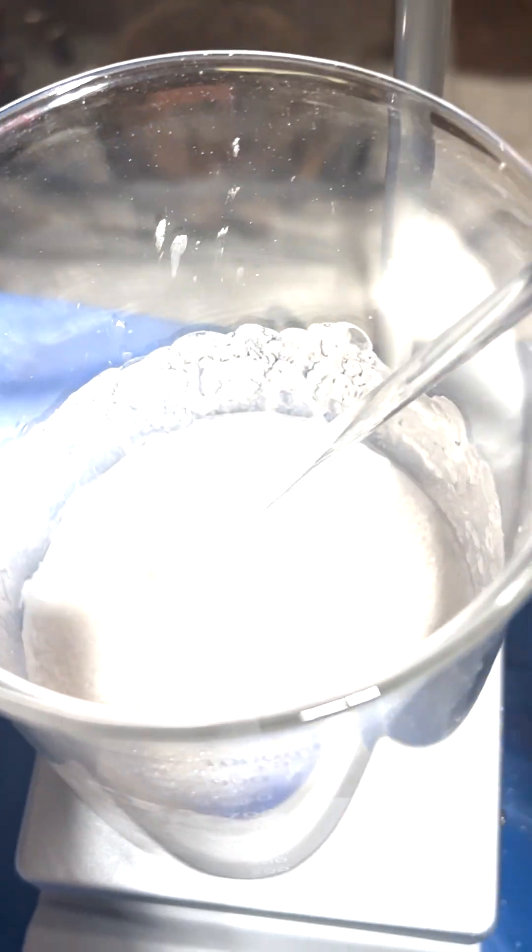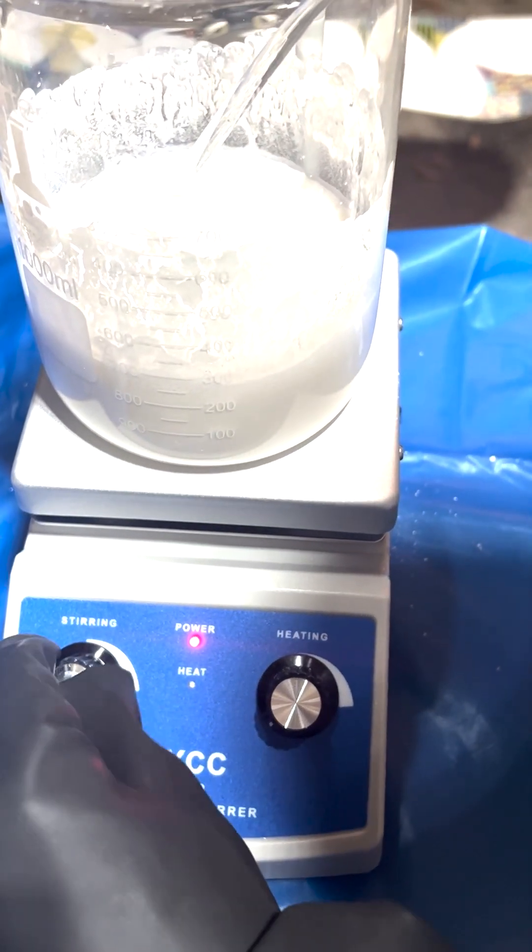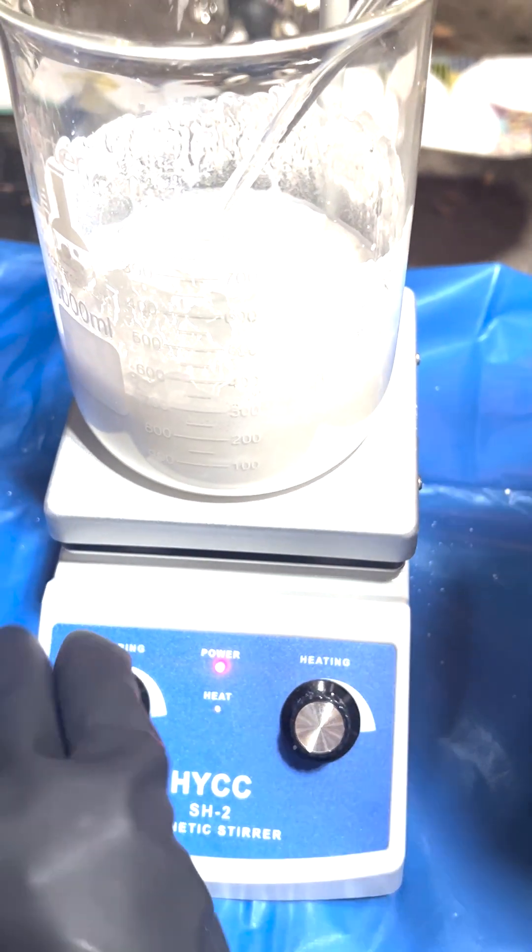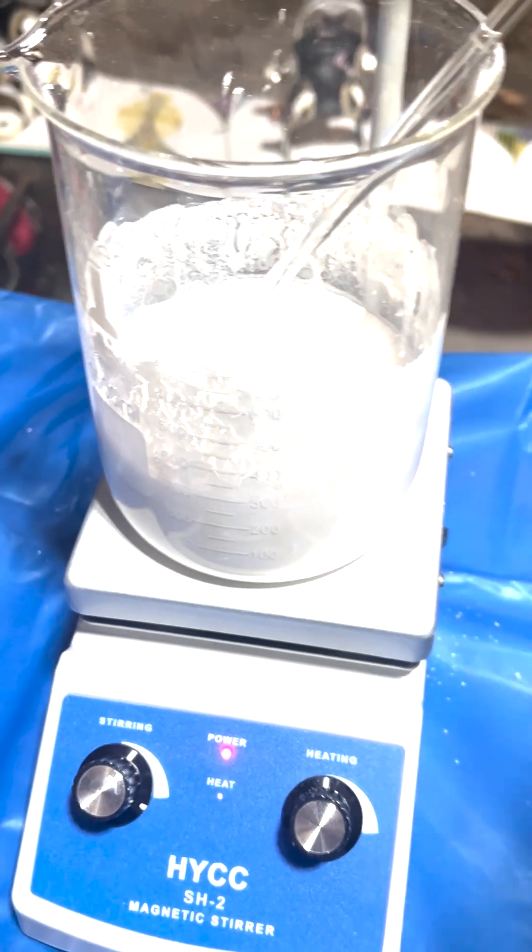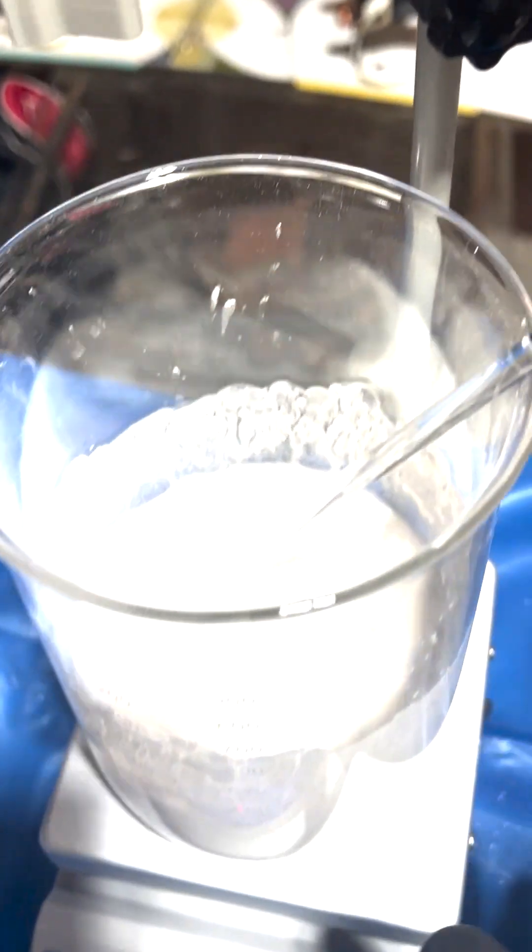Actually, I'm going to turn on the stir rod here just to make this go faster. So when they mix, it produces calcium acetate, which is what we want to mix later on, and a byproduct of CO2 gas, and that's what these bubbles are on the top.